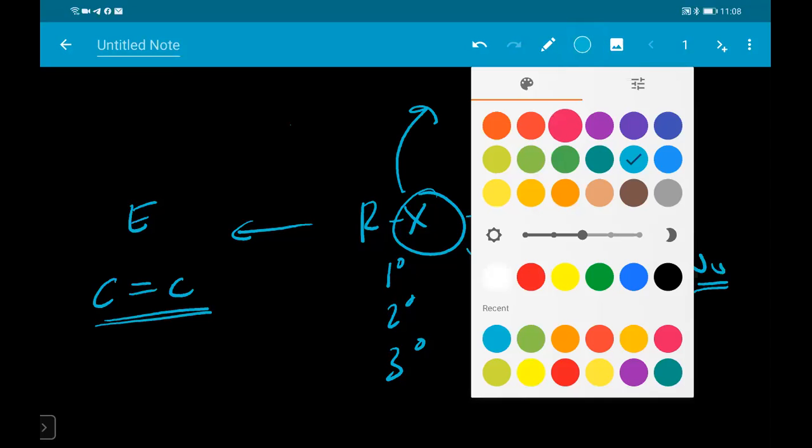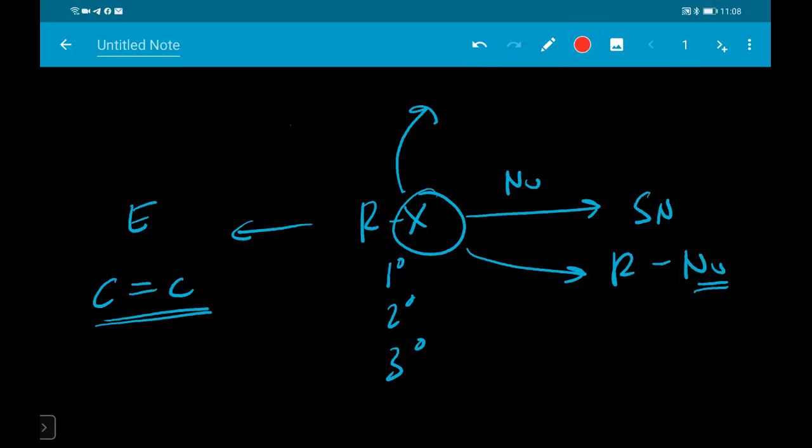However, for this experiment, we're not going to talk about the elimination, we're going to focus on substitution saja. Clear tak part ni? Yang eksperimen sini adalah berkaitan tentang reaction apa? Substitution. We're going to ignore the elimination first. So you go to the notes and look for the substitution reaction.